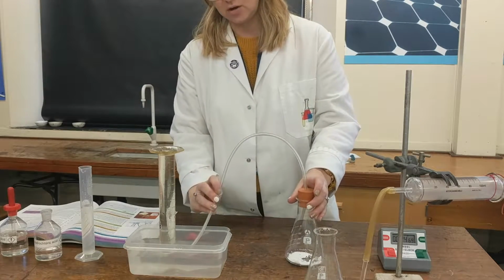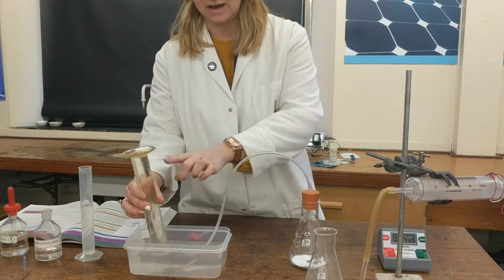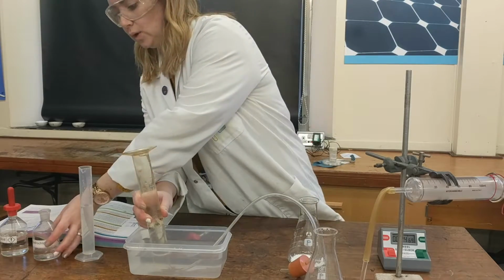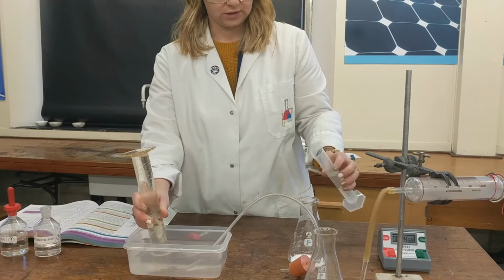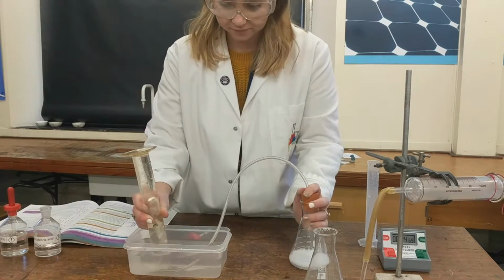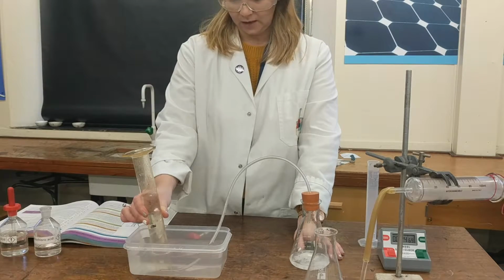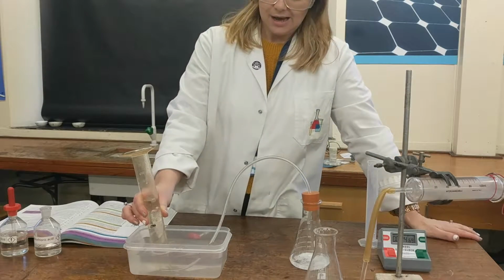This time this has got to be underneath the measuring cylinder to ensure that the gas is going straight into there. And you've got your divisions on the measuring cylinder here to see what you've got at what particular time, every 30 seconds. So again, we will put in the 40 centimetre cubed of acid. So its reaction started straight away. And you can see the bubbling of gas that's being produced, carbon dioxide gas that you're making. And you can read on here every 30 seconds or less or more how much gas is made.